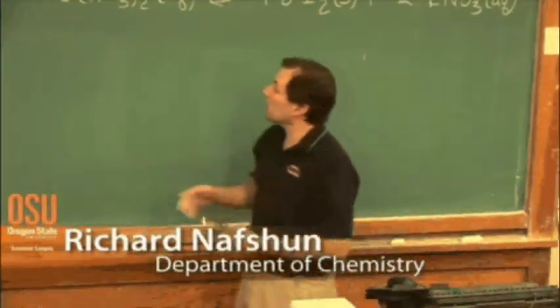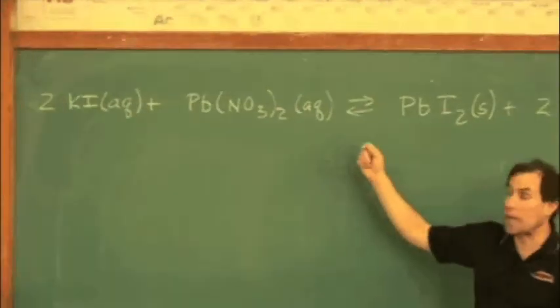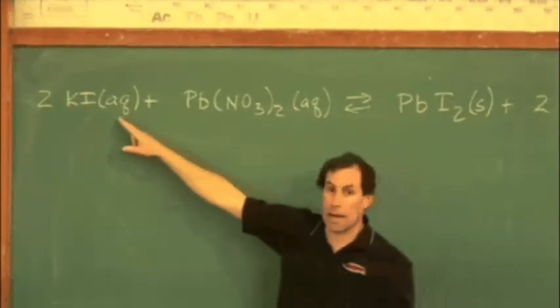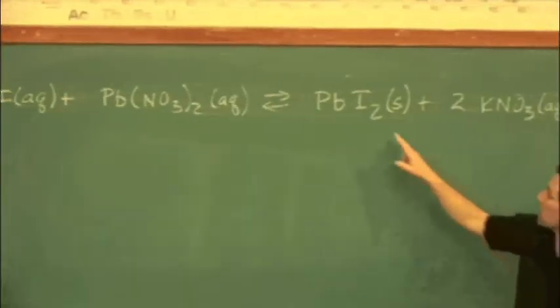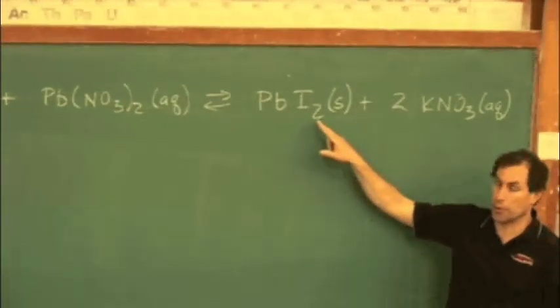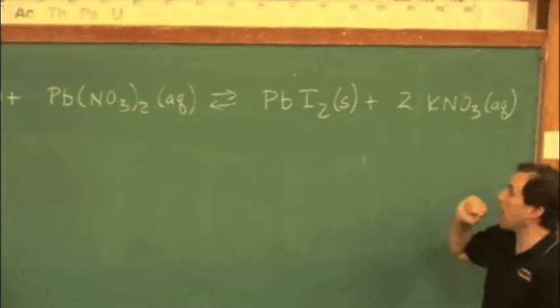A precipitation reaction takes place when we take two solutions. We have aqueous solutions, meaning in water, some potassium iodide and some lead nitrate. We're going to form a solid, and that solid is going to have a nice little color to it. You'll be able to see it clearly in the demonstration in a moment. That solid is going to be lead iodide.